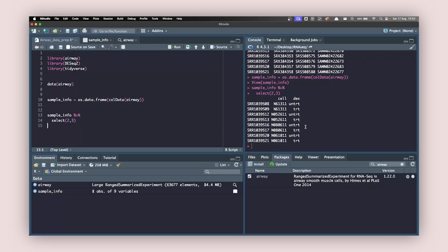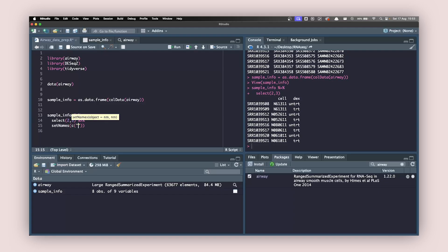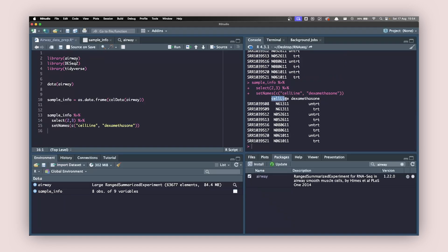Next, I want to change the column names to their full names — cell line and dexamethasone — so I can work with them properly. To do that, I pipe the result into a command called set_names, and inside set_names I use a concatenation containing first cell_line and second dexamethasone. Hit Command+Enter and you can see it has changed to cell_line and dexamethasone.